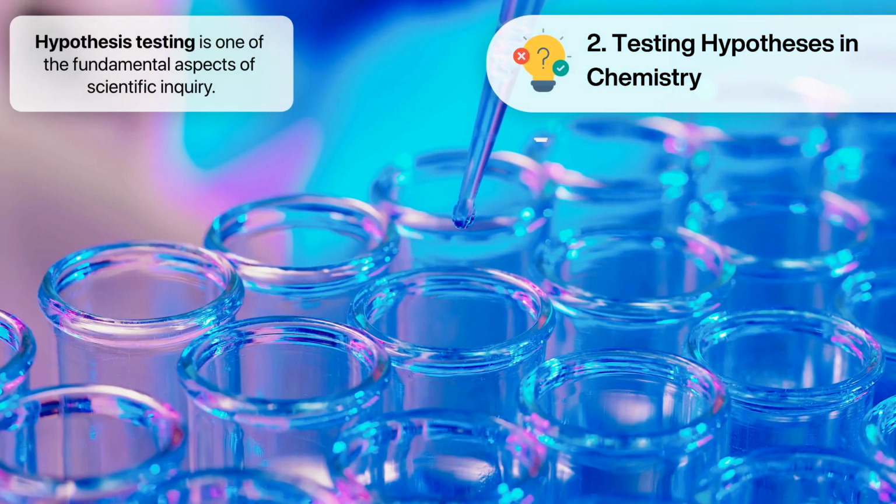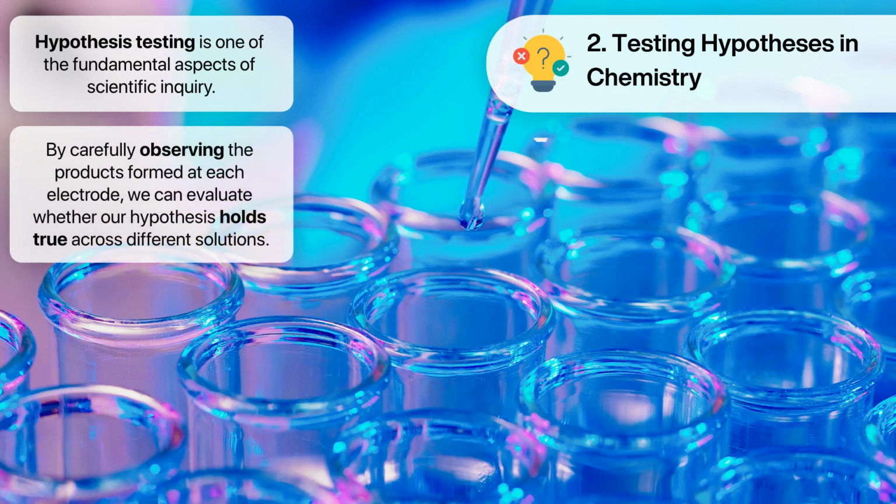Secondly, this practical gives you the opportunity to engage in hypothesis testing, one of the fundamental aspects of scientific inquiry. By carefully observing the products formed at each electrode, we can evaluate whether our hypothesis holds true across different solutions, deepening our understanding of electrochemical principles.